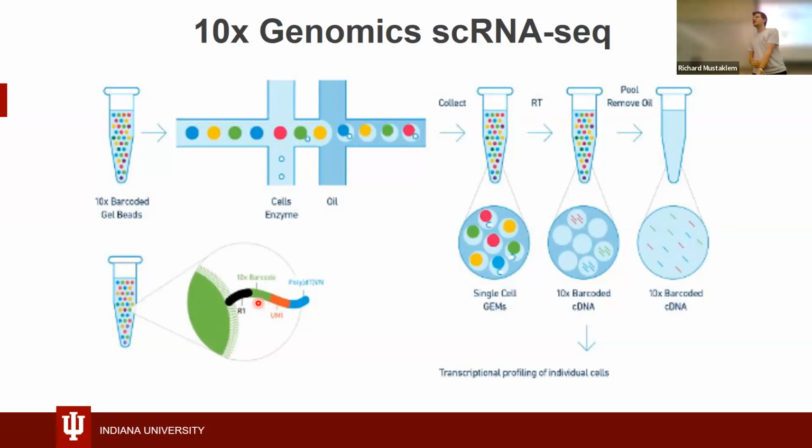That's what's called quality control. When you go in and look at how many doublets you have, and just remove them. That was a good question. Sometimes you'll run into problems where you'll have 2 cells in one well, or a mix up with the barcodes. It doesn't always attach correctly. Then you go in and do quality control, and you're throwing away data, but it's also dirty data. So you're not really throwing it away. You're basically cleaning the data.